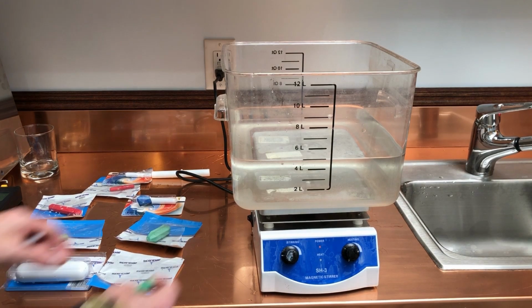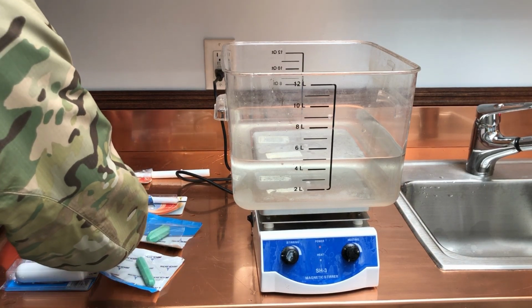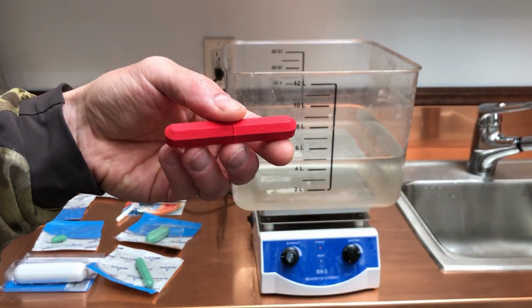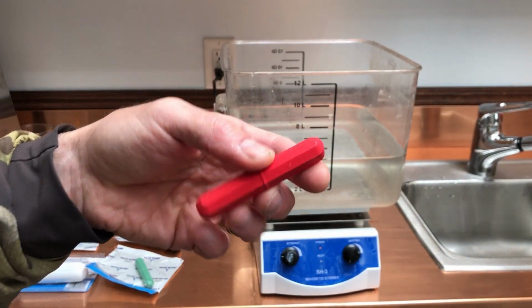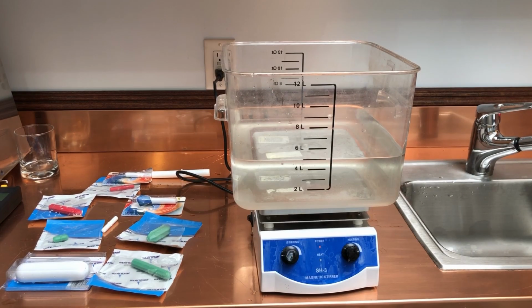The magnetic power on those is on the weaker end of the spectrum, and that is also true for the red ones. If you want a higher powered magnet, then there's green ones. They're samarium cobalt. It's about three times the magnetic power. They're still autoclavable. They cost more, and they work up to 350C or 662 Fahrenheit.